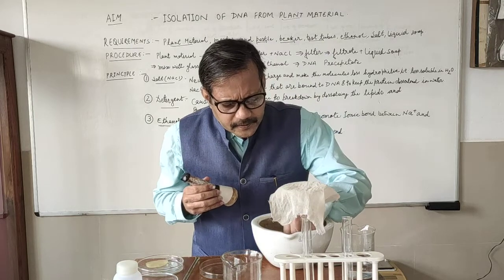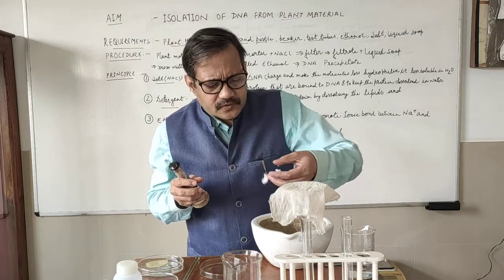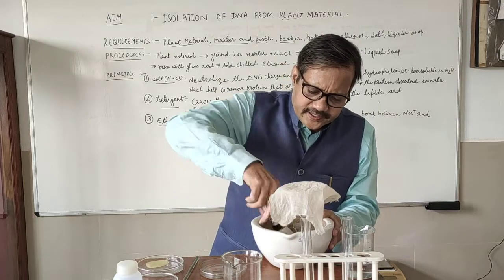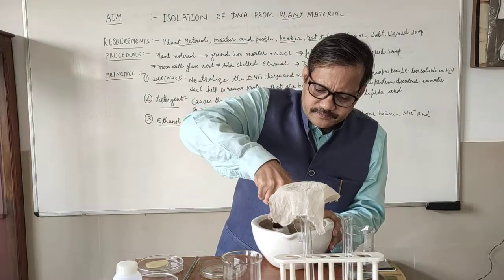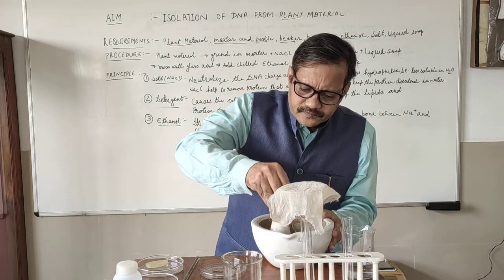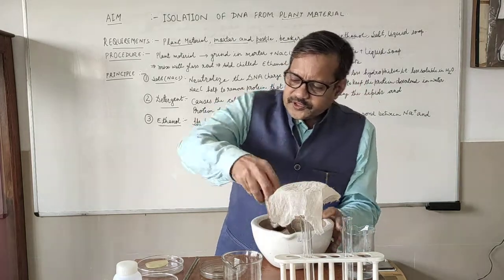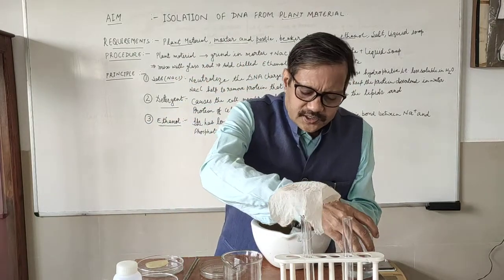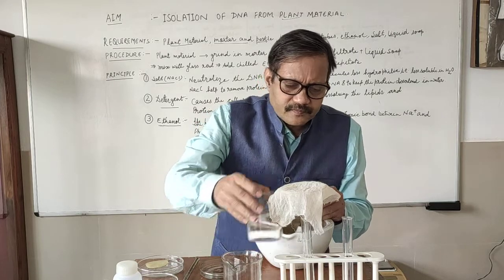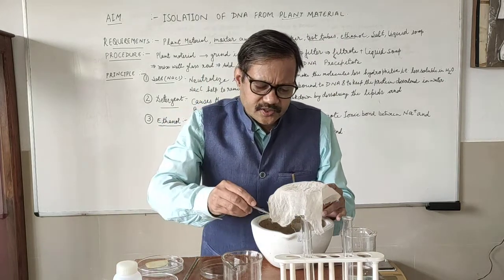This is a plant material — we have taken onion. We need to grind this onion. We need to grind it. Now we get the paste, add some water. Then we add some salt — NaCl here.